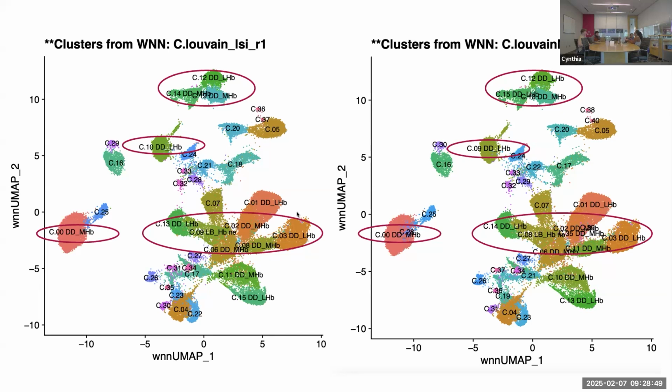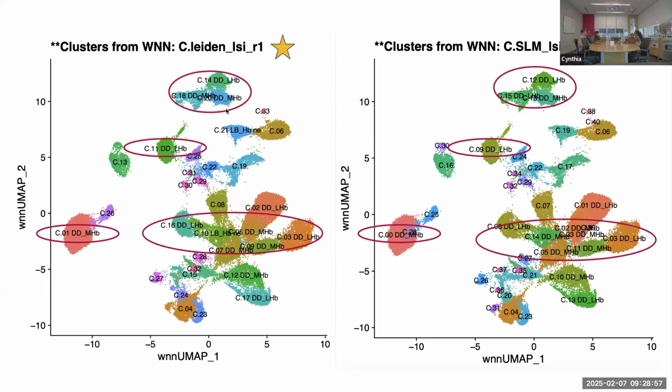But this is just to have annotated the clusters in order to make a more accurate interpretation. So this is for Leiden. And you can see that in all the algorithms, we have the same cloud in the middle, and we have here like three small communities in this side. So most of the clusters have pretty much the same information represented in the outputs.